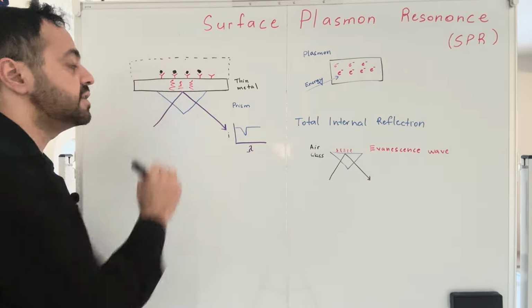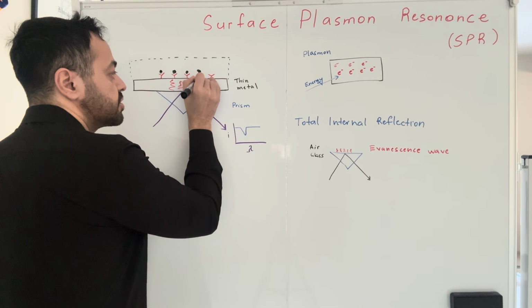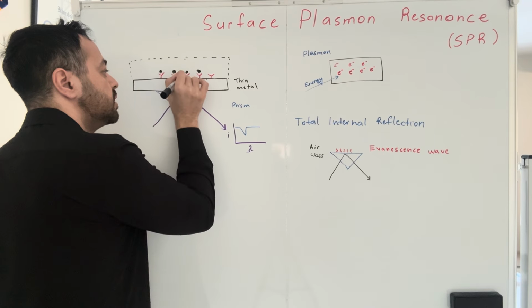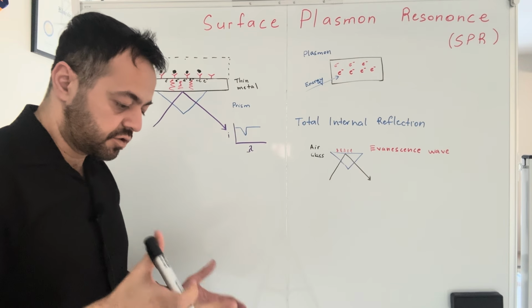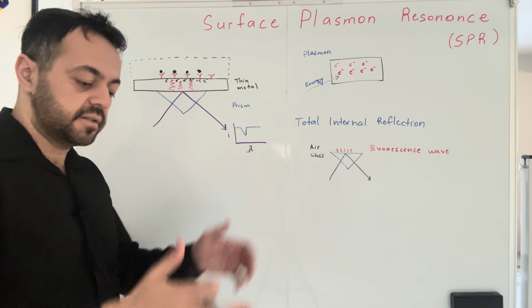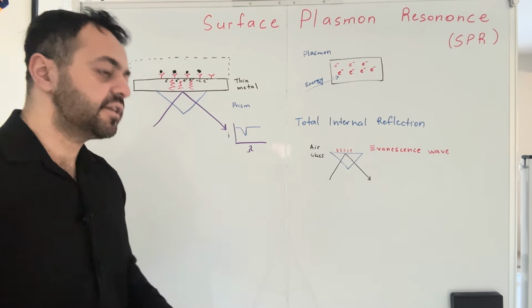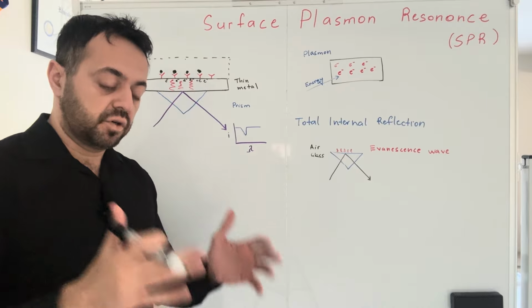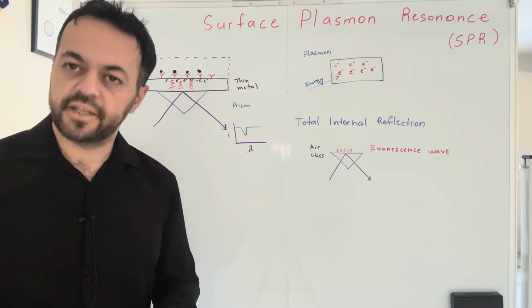So that's why we need this evanescent field, because on the thin metal we have lots of electrons. So e, e, e, e, e. A lot of electrons on the surface, and we're not applying the evanescent field, we apply the incident light that will generate the evanescent field. The evanescent field is starting, causing this plasmon to collectively oscillate those electrons.